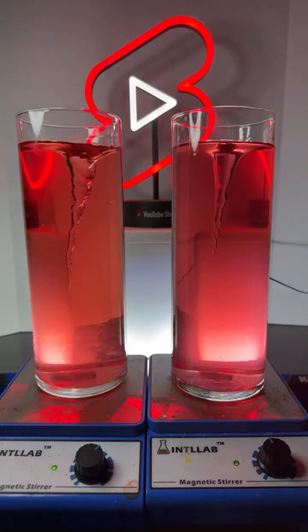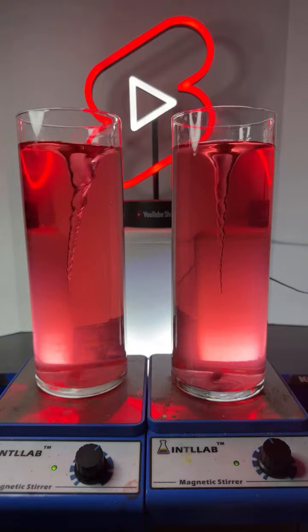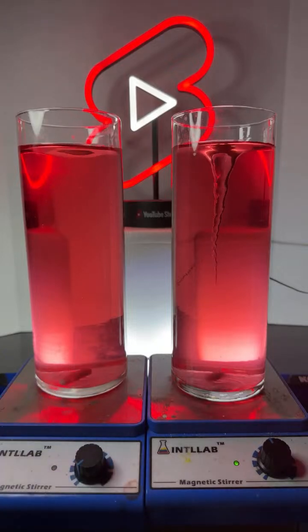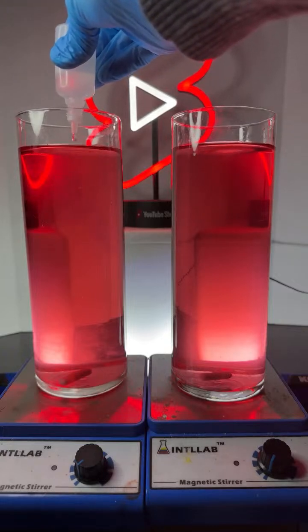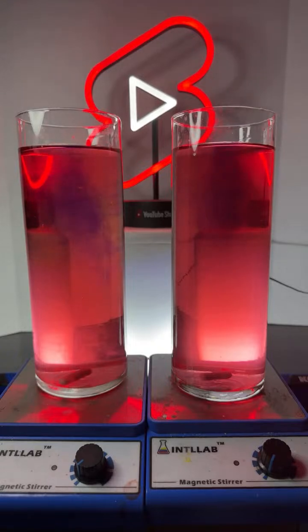Kara, I'm trying. Jim Bros, nice to have you back. I'm trying to get the double rainbow for you. You'll notice I got pH nice and low. Here, let's do this. This is kind of fun. I turn the stir speed off, and then I'm going to add a little bit of base to both, and we'll see what happens. You got it, Jim Bros.